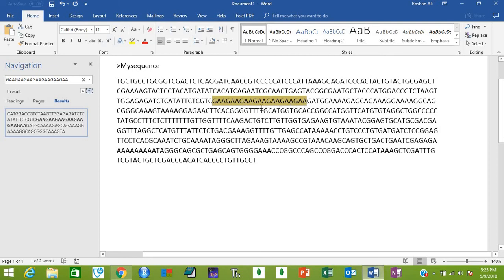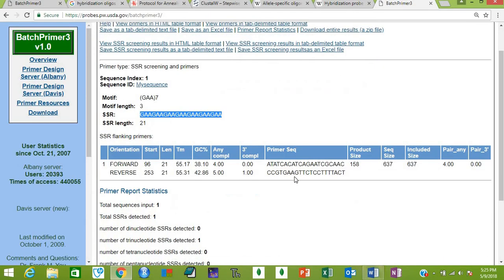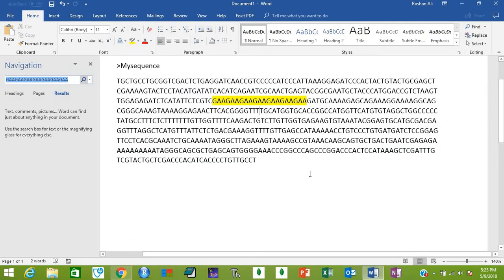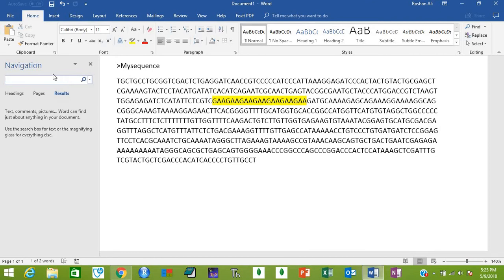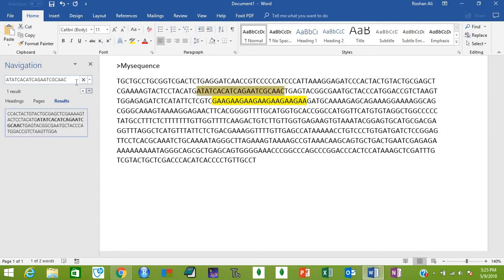Now let's go to the website again and select this forward primer to see where it can bind to our sequence. Again, Ctrl+F, remove the already pasted sequence, paste your new sequence - that is your forward primer - and press Enter. This is where your forward primer will bind. Select this and highlight it in green color.